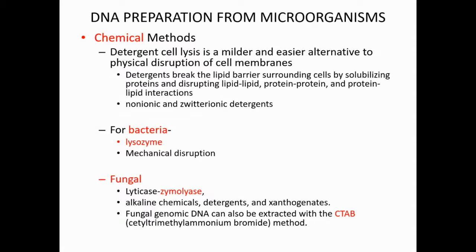And for bacteria, we have to break the cell wall and release the cell contents. A commonly used chemical is called lysozyme.